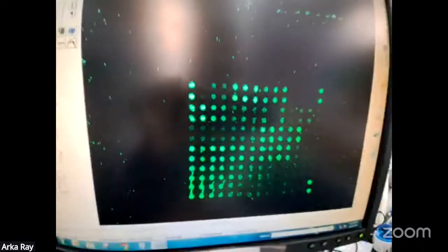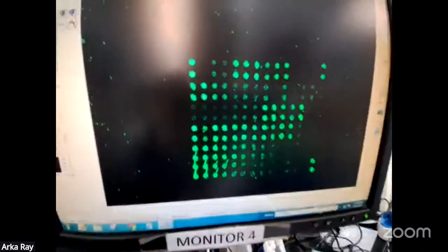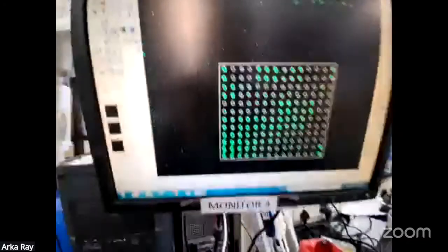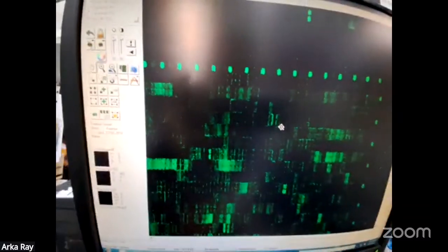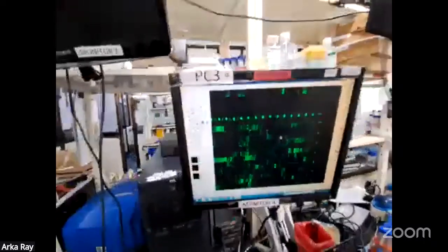But you need to do a lot of things, like the block boards. Initially when you place the grid, it is not uniform, so you need to place it properly. Now this is the protein array. Let me give you a brief look at the peptide arrays as well. So this is the peptide array. You can see this one. I think this is fine.